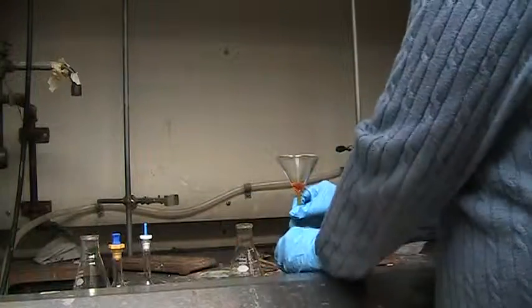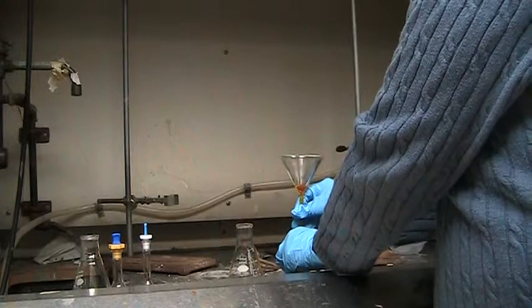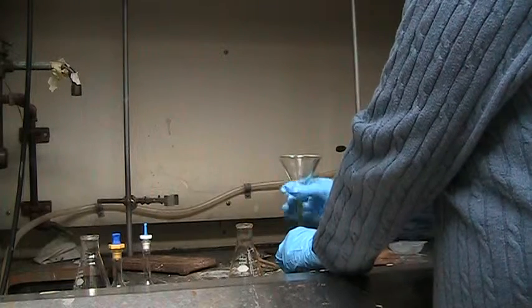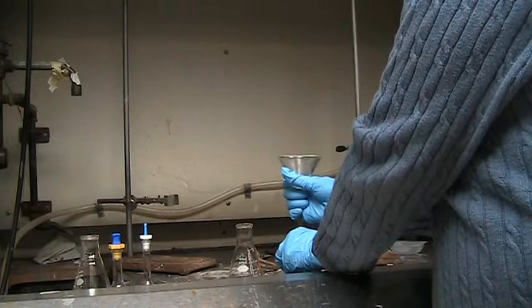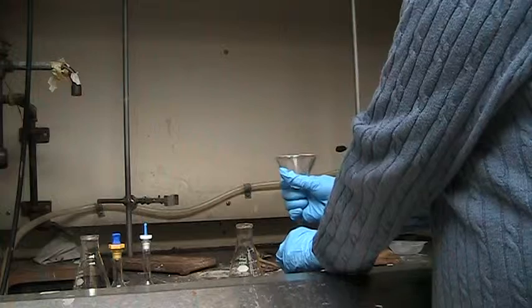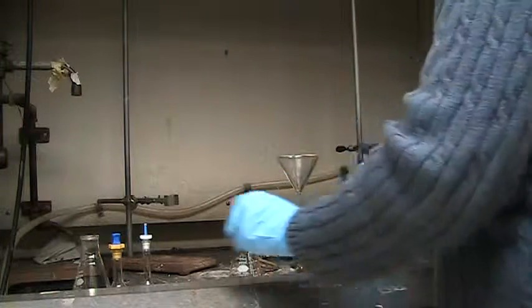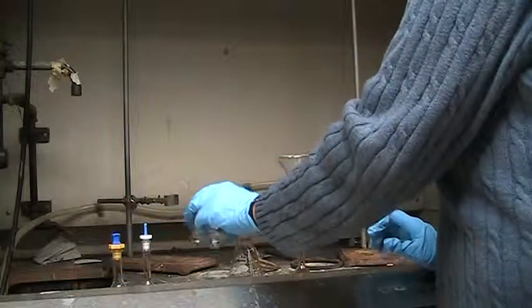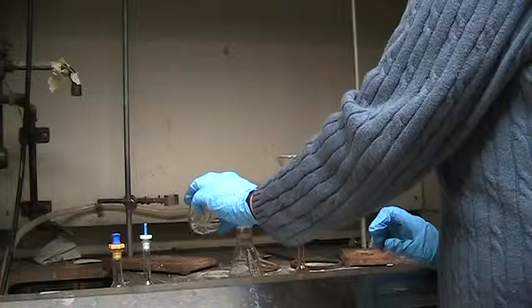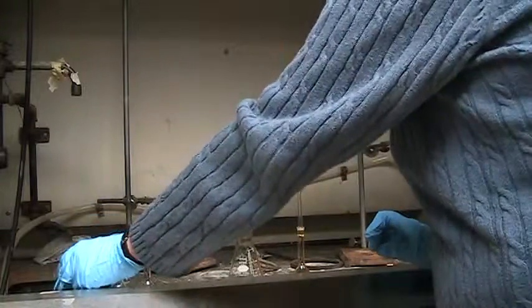I want to transfer this solution quantitatively. So after I'm done transferring the material in the vial I'm going to use some clean dichloromethane in order to rinse the flask.